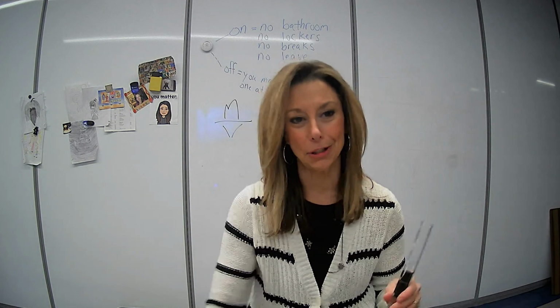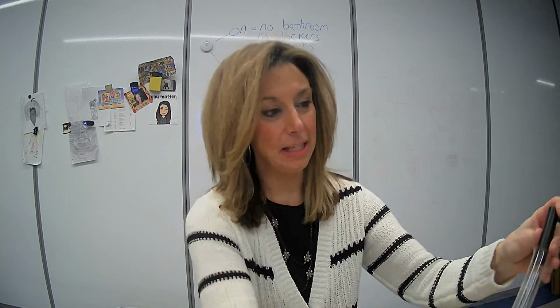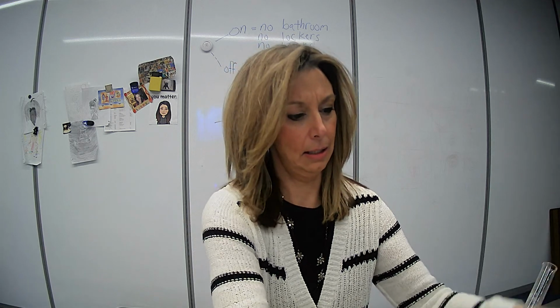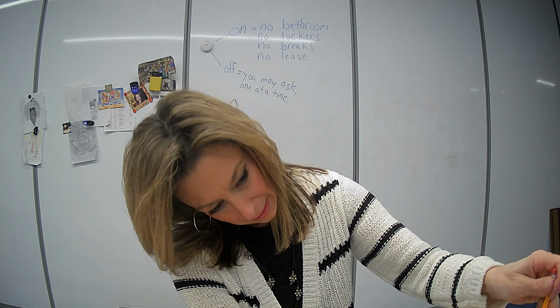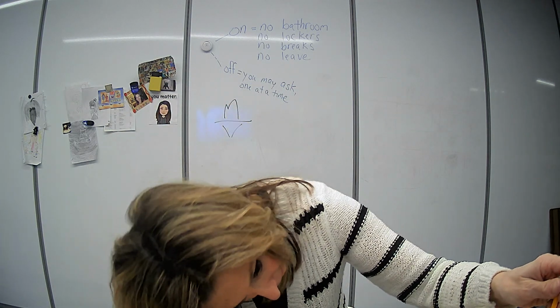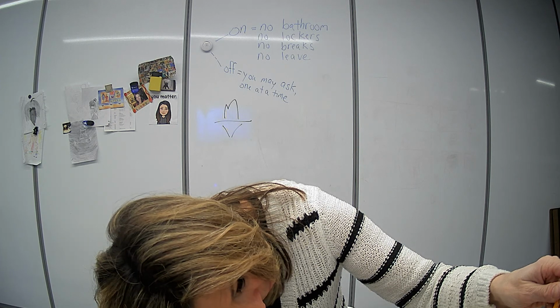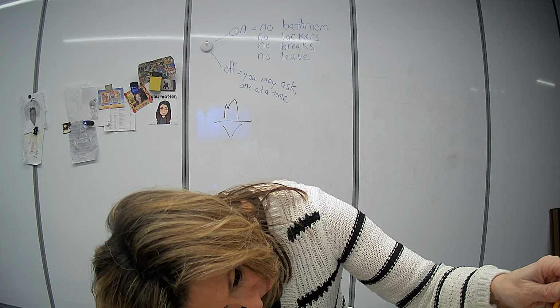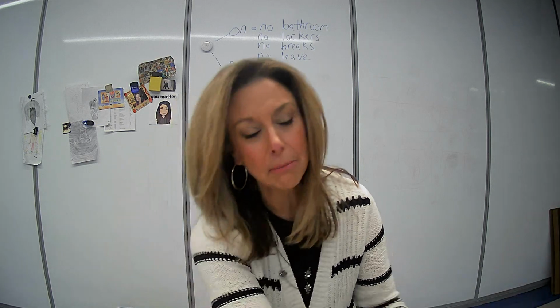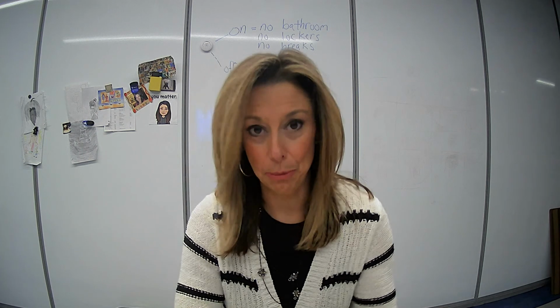Maybe you can make a prediction on what the last one's volume is going to be. All right, final cylinder, dropping it in and pushing it down. And it is 39. Okay, so what's 39 minus 25? 14. Is that what you predicted?